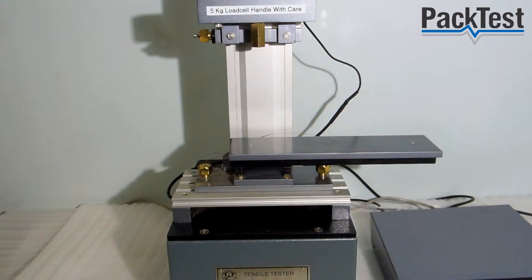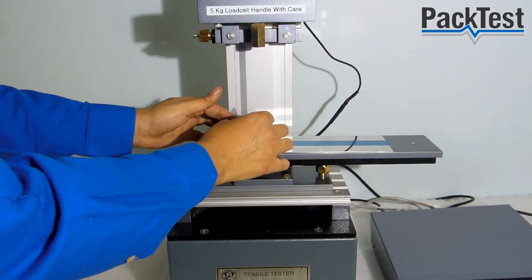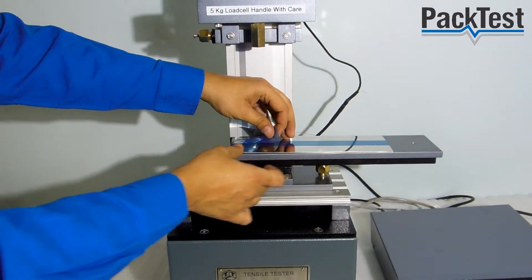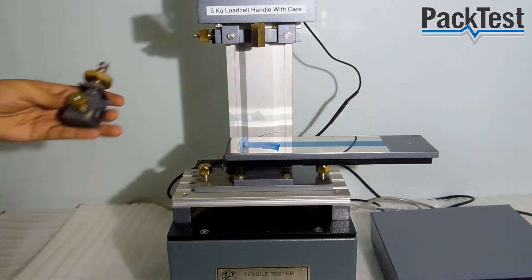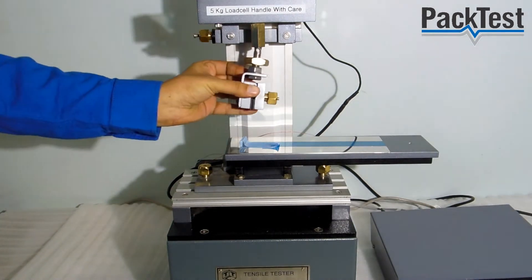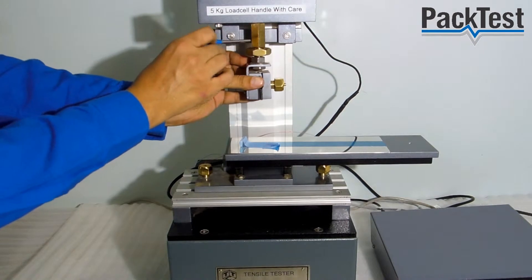Place the metal plate along with the sample onto the base plate. Fix the top grip as shown here and lock the check nut to hold it in position.